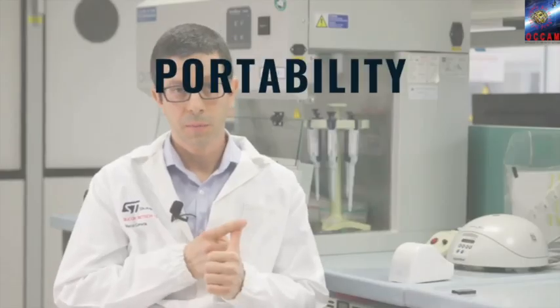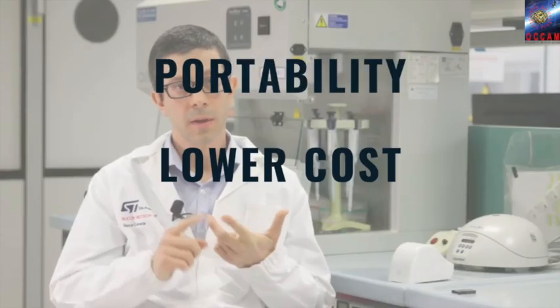So, we have a series of advantages compared to traditional qPCR equipment: portability, lower cost, and ease of use, without sacrificing performance. All of this allows taking molecular analysis out of the big, highly equipped laboratories and making it more accessible. And this is exactly what the University of Nairobi is experimenting with.